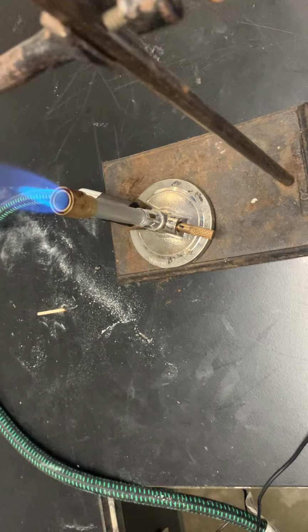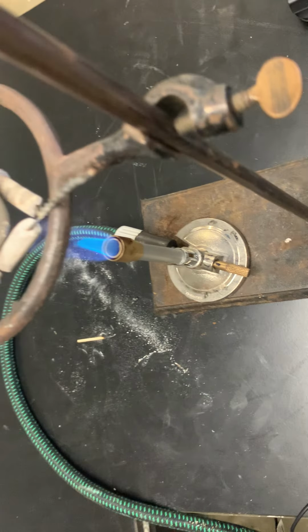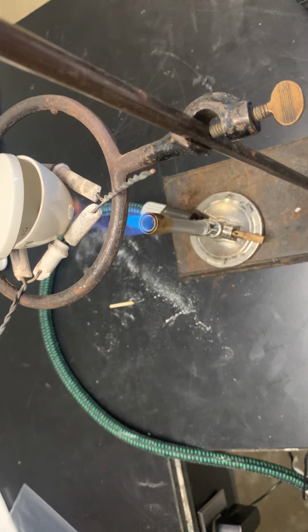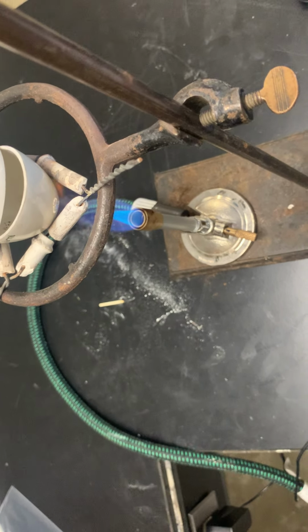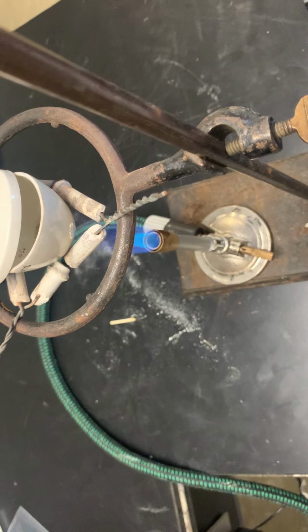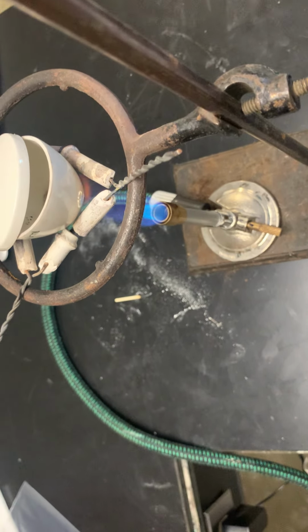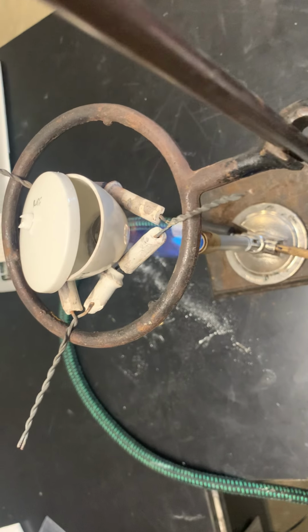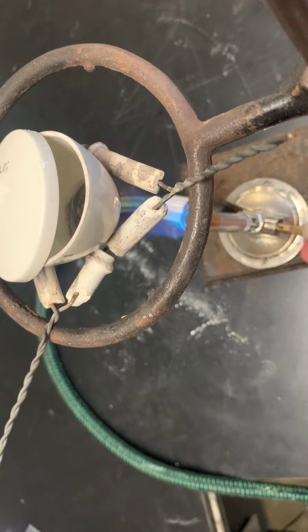Basically, all I'm trying to do is warm this up, because if you heat and cool something like ceramic or rock, even metal, rapidly, what ends up happening is it cracks. Doesn't explode, but it cracks. All right. So we're gonna crank this up a little bit more.